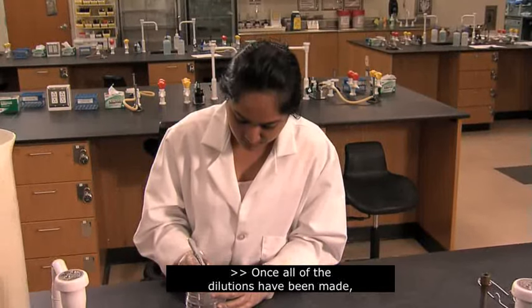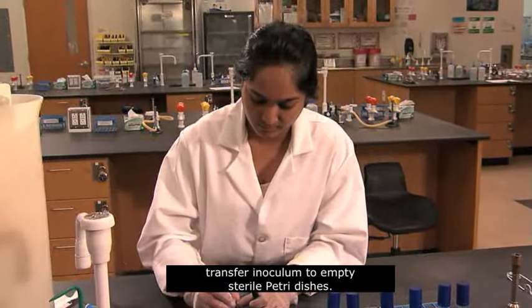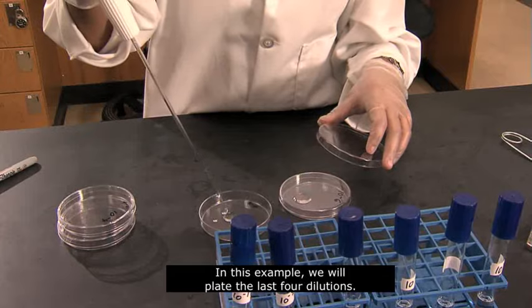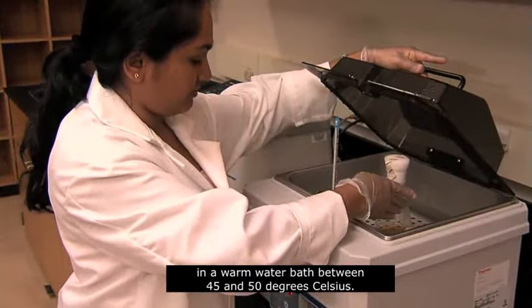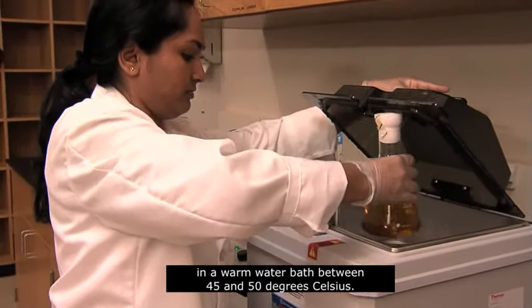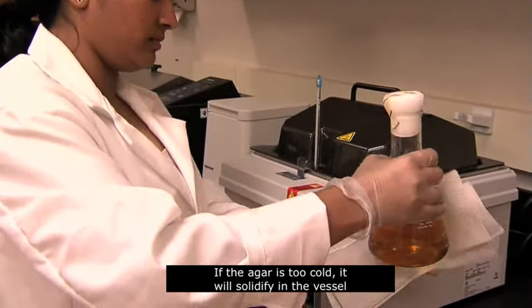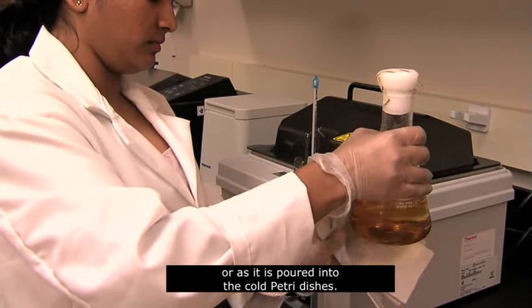Once all of the dilutions have been made, transfer inoculum to empty sterile petri dishes. In this example, we will plate the last 4 dilutions. The melted tryptcase soy agar should be kept in a warm water bath between 45 and 50 degrees Celsius. If the agar is too hot, it will kill the bacteria. If the agar is too cold, it will solidify in the vessel or as it is poured into the cold petri dishes.